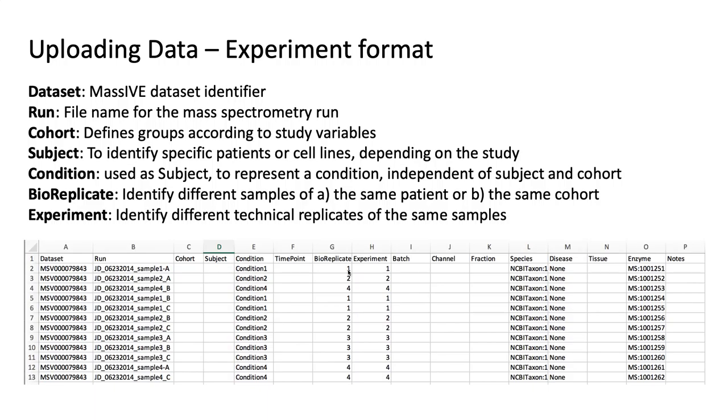It's very similar to what you have for MSstats, but there's a couple of extra fields that have been added to describe a bit more metadata about the experiment that is not necessarily used immediately by MSstats, or is something that in the same experiment you might want to do different kinds of questions. So sometimes you have time points, you have different conditions, you have different individuals or cell lines. So there's a close mapping to the MSstats format, but it's a couple more columns in there.